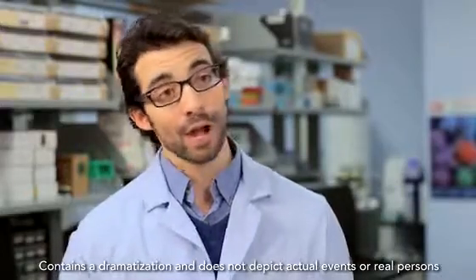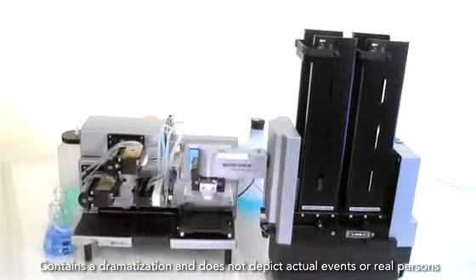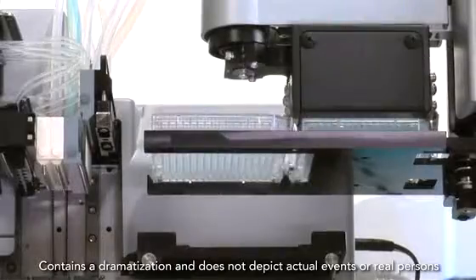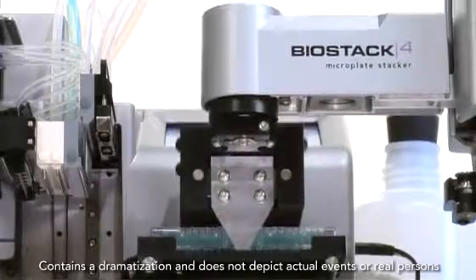Multiflow FX is modular and scalable, so it can grow and evolve as we do. And it'll be easy to integrate into an automated system, especially as we really ramp up our throughput.